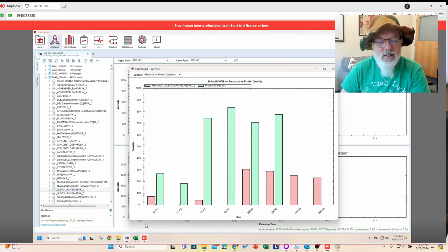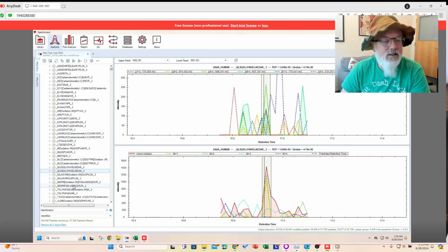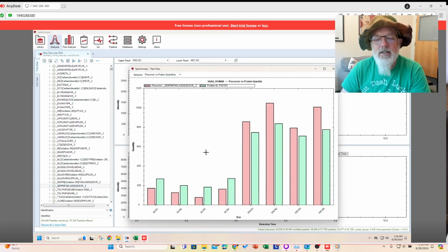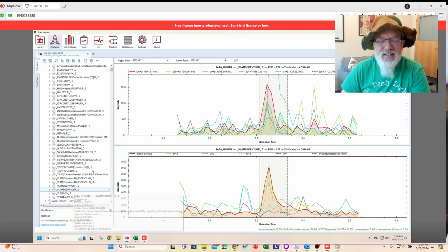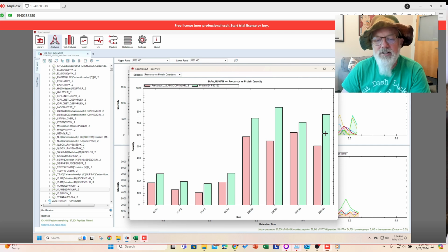This is kind of a crappy signal. Let's see how that looks. See that protein quantitation is not very good. Okay, so here's the precursor, and you see how they're higher in the 200s, just like you would hope, because we loaded 4 times as much. All right, let's see here. And here you go. Boom, just what we expect.